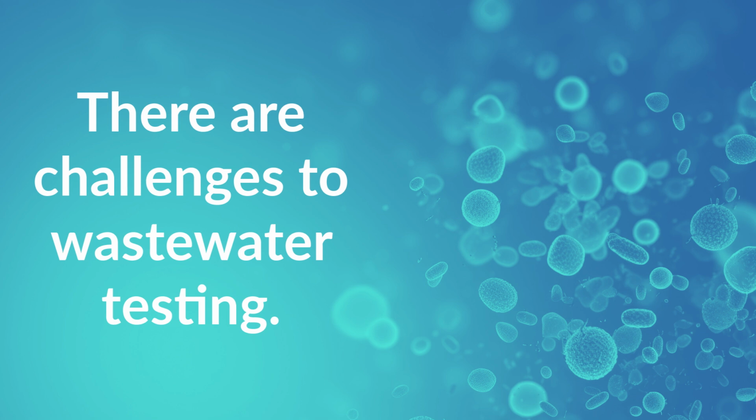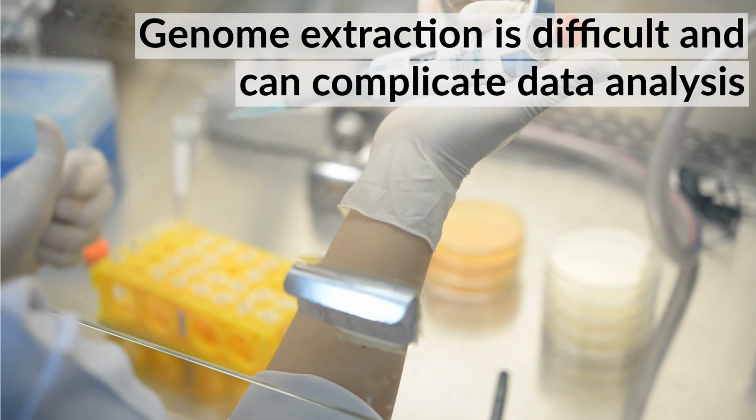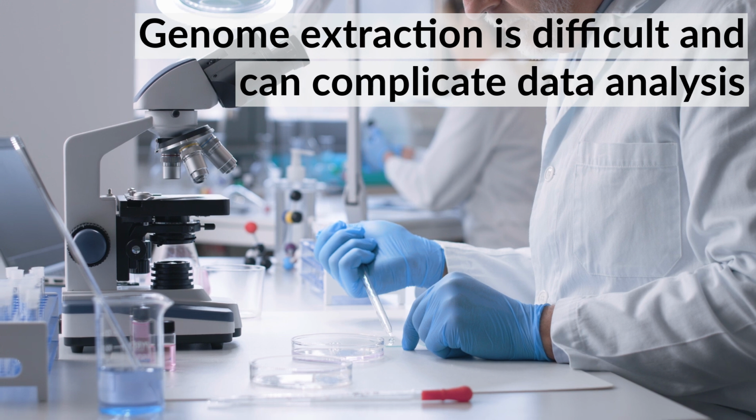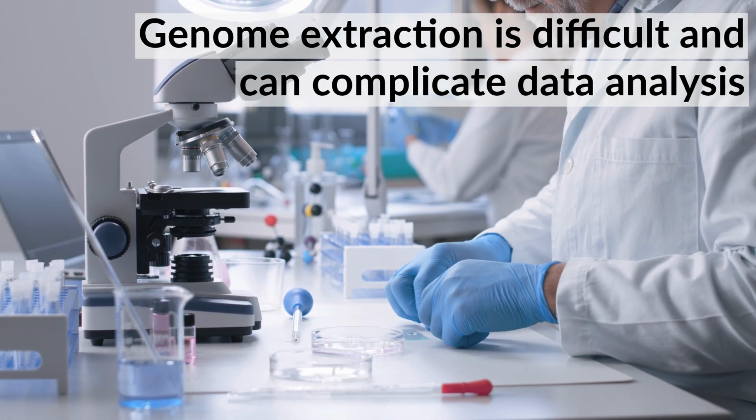Of course, wastewater testing isn't without challenges. Isolating DNA from wastewater is complicated because the sample contains genetic material from many sources. This makes it challenging to pinpoint specific pathogens that may be present at a low concentration in the water sample.